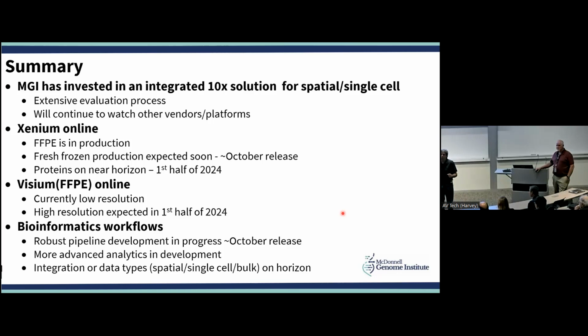Whereas Visium is different. Visium says, okay, we're going to tag all the RNA that we find in there, and then we're going to make a library out of it and sequence it. And then we'll tell you where that came from on the slide. So it's basically doing a whole transcriptome level analysis, as deep as you can go with these types of technologies, and telling you everything that it's finding in those spaces, but it's lower resolution.